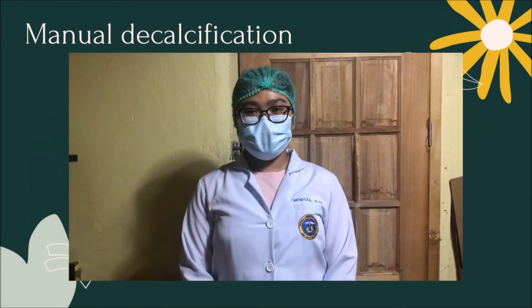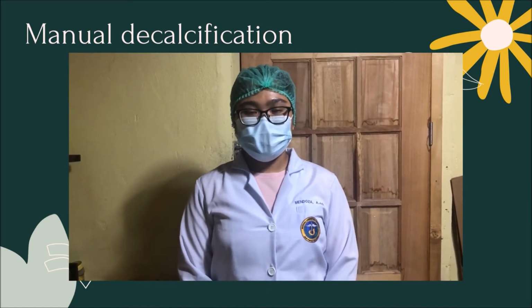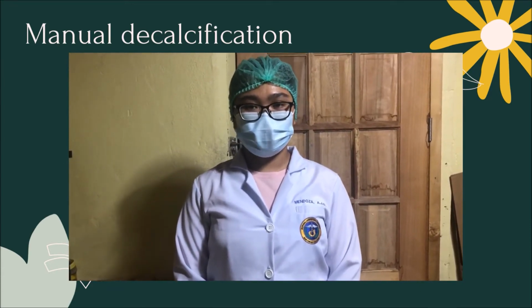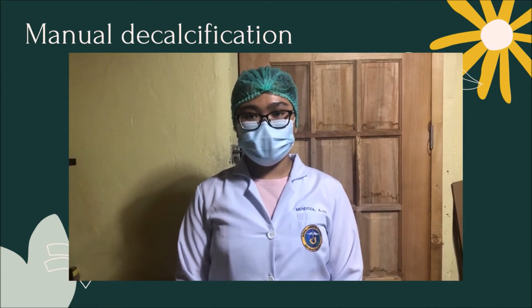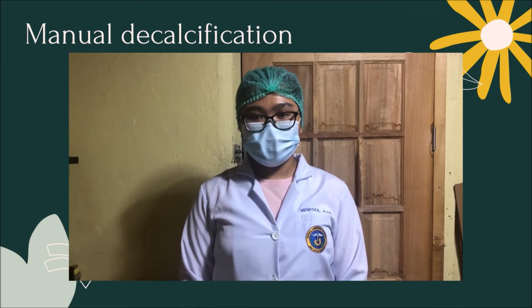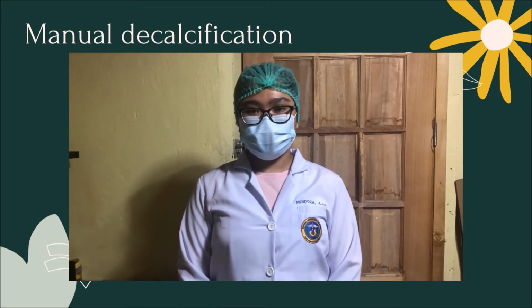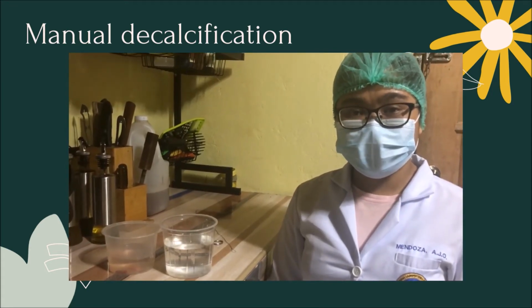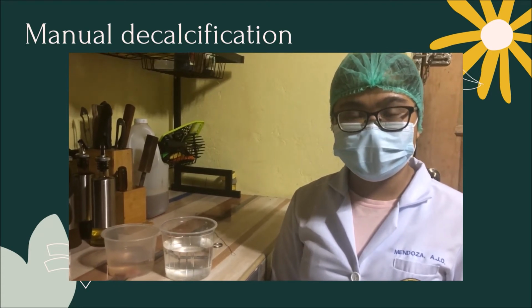Good day everyone, I am Mendoza and I am doing decalcification. So decalcification is the process of removing calcium ions from the bones or calcified tissues through a histological process for it to become more flexible and easier to cut. So it is actually done after fixation and before dehydration. Now first, we will place the calcified tissue into a 500 ml beaker filled with 10% nitric acid.